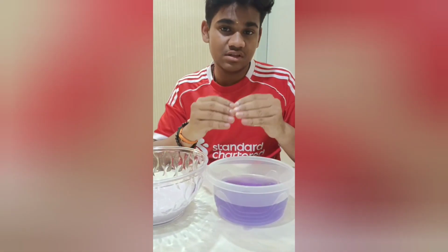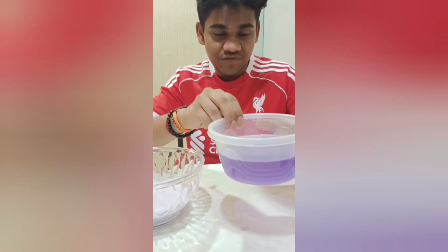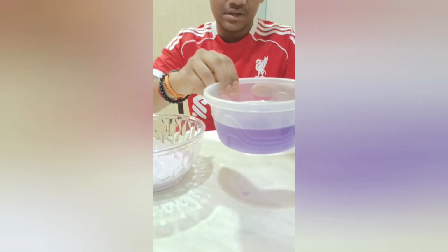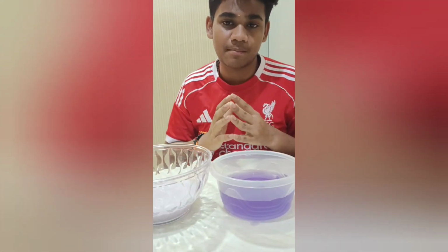However, if the water turns green or yellow, that means it is alkaline. As you guys can see, the fish tank water still stays purple. That means it is neutral. Okay, as I said, based on my research.